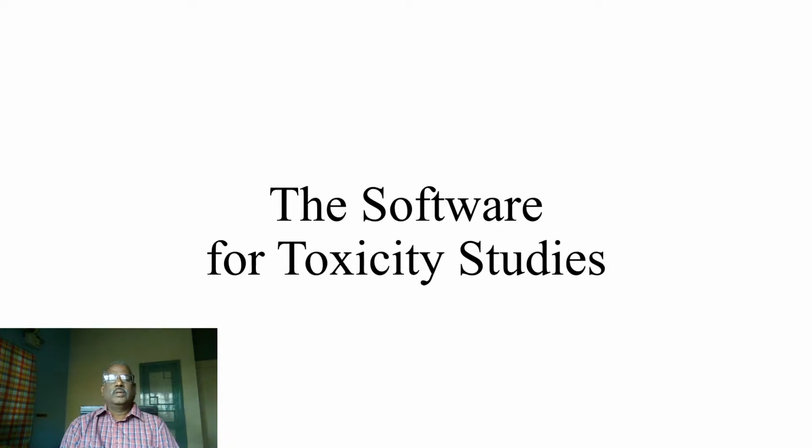Good morning to all. In this series of lectures, I will be discussing the software used for teaching pharmacology practicals and also for doing research to establish the toxicity of some particular chemicals.